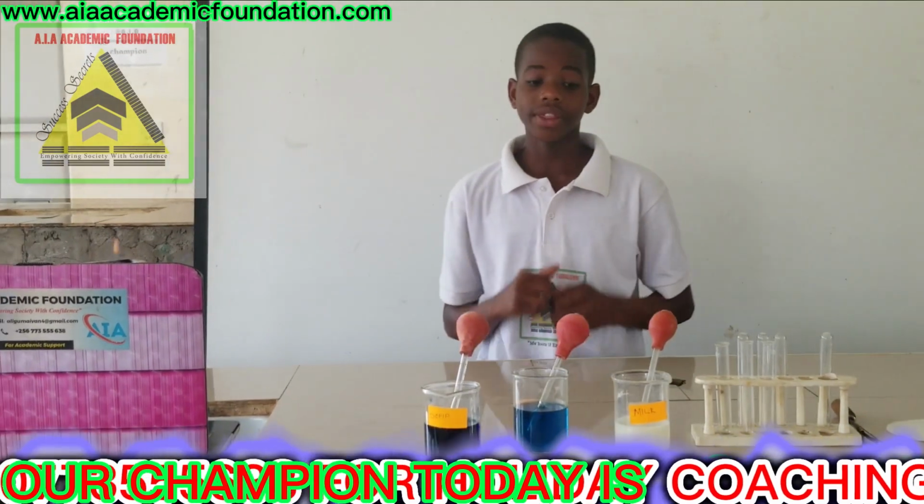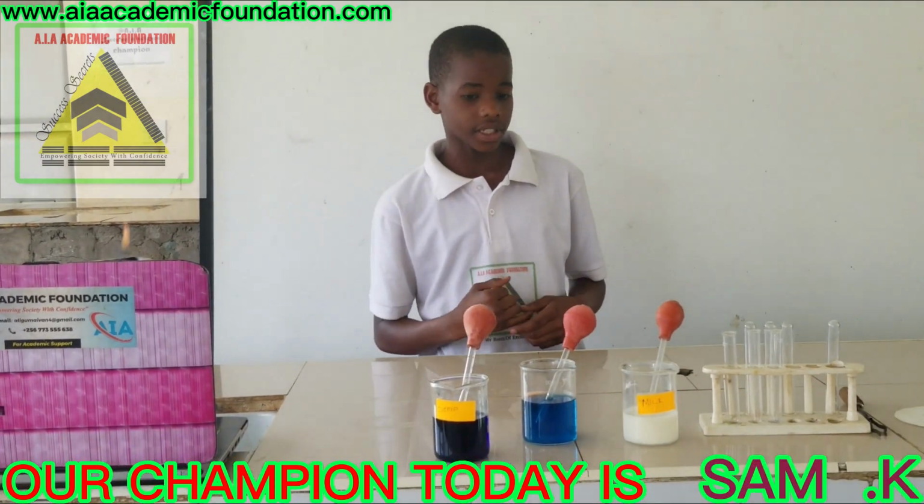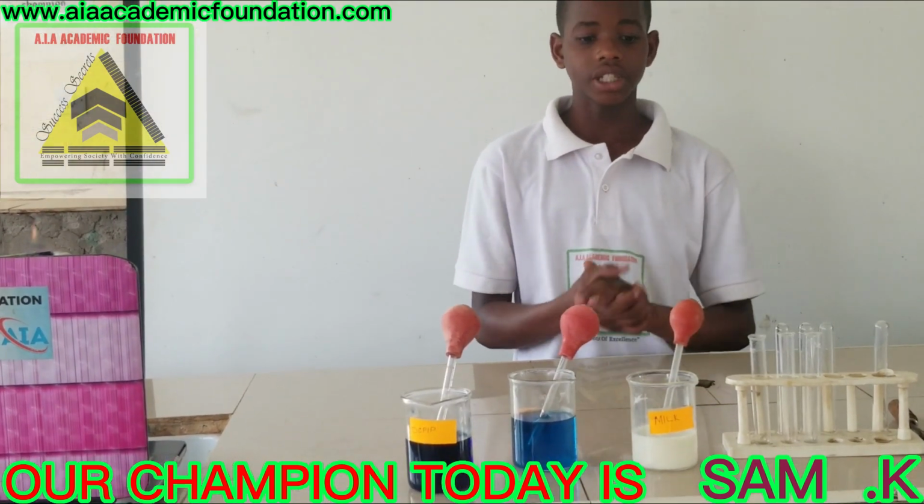I'm going to test whether there is vitamin C, lipids, water, and reducing sugars in milk.